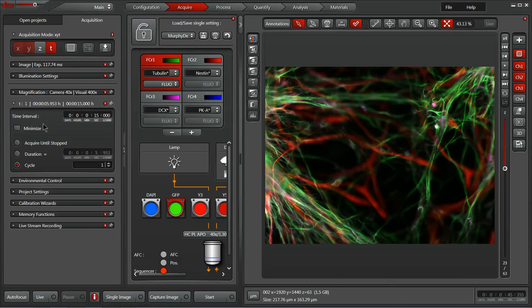This will control the intervals with time. Beneath that, we can control the total duration a couple of ways. The first is with an actual number of cycles, where we can say we would like 10, 20, or 30 data points. Or we could use a duration of time — for example, if our reaction is going to take two hours.